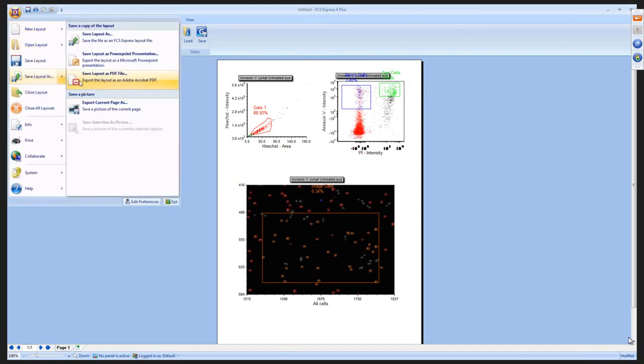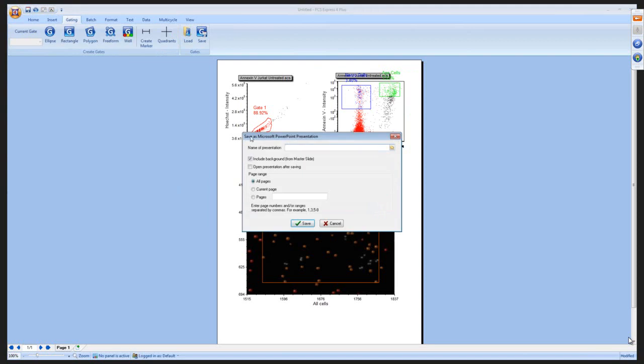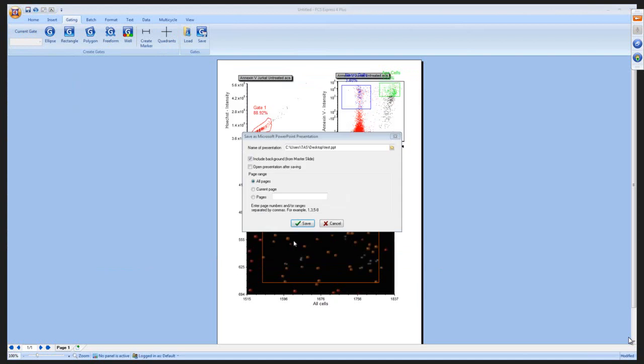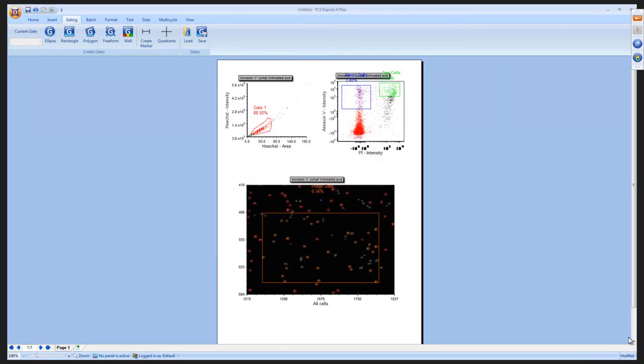And let me put this on my desktop, and give me a moment here as this appeared on my next screen. And we'll open it after saving and click Save. And what's going on now on my other screen here is that PowerPoint is trying to open up, and we'll give it a minute here as I have a lot going on.